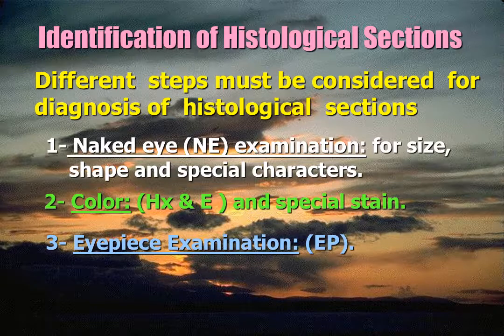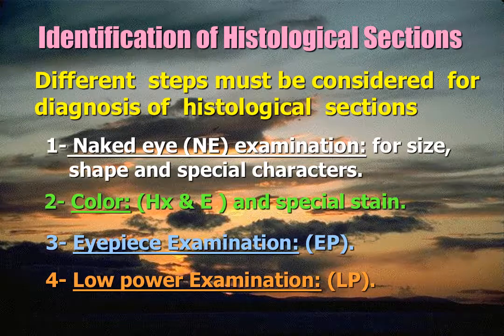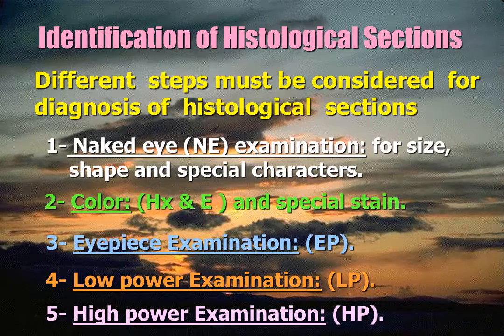Examination by eyepiece of the microscope, EP. Examination by low power, LP. Examination by high power, HP, for details of the histological section.